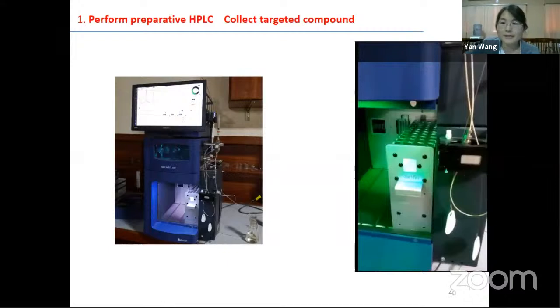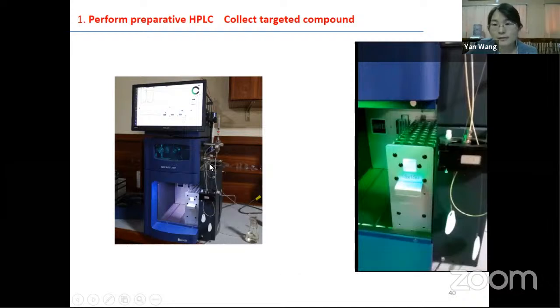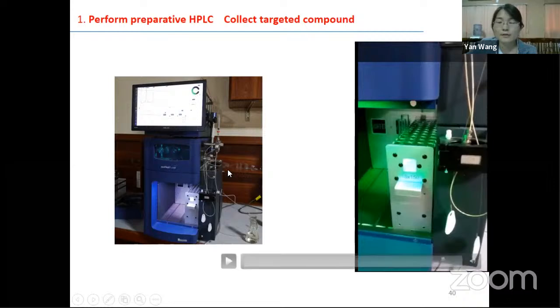The previous old one and this advanced one have the same target. Only with the old one, we have to do something manually, and with the advanced version of the preparative HPLC, things become easy. Your work is reduced, but your target and your achievement, your purified sample, all these are the same.